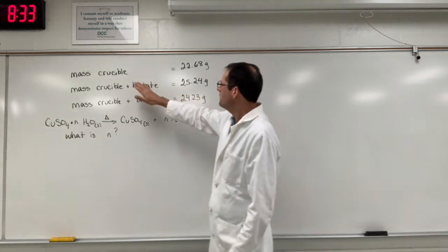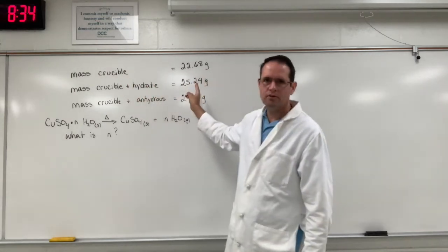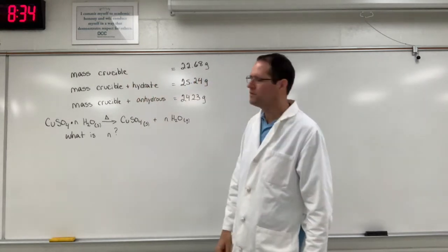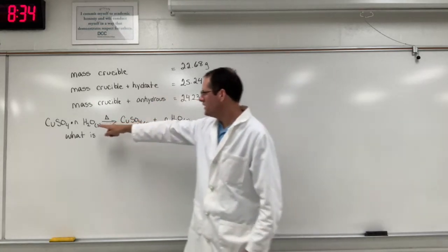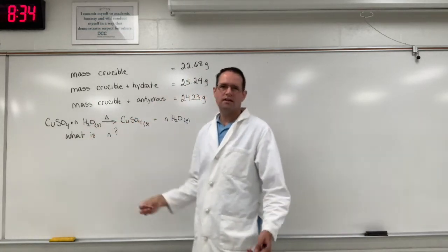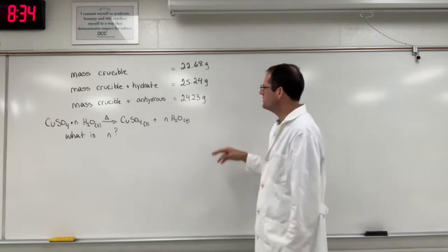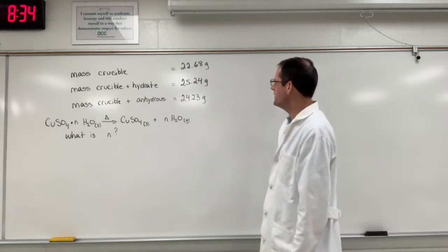So we have the mass of the crucible which I've written that number down, 22.68 grams. The mass of the crucible and the hydrate—remember that's the copper sulfate that contains water molecules entrapped within the crystalline lattice—that's 25.24 grams.